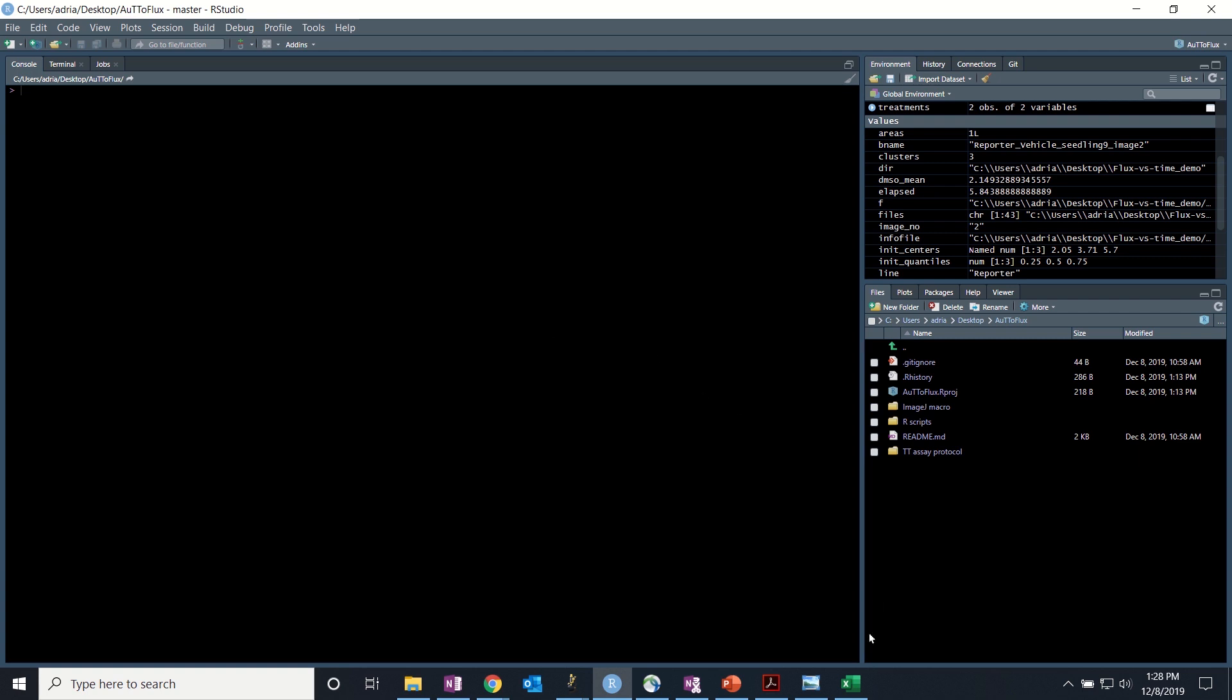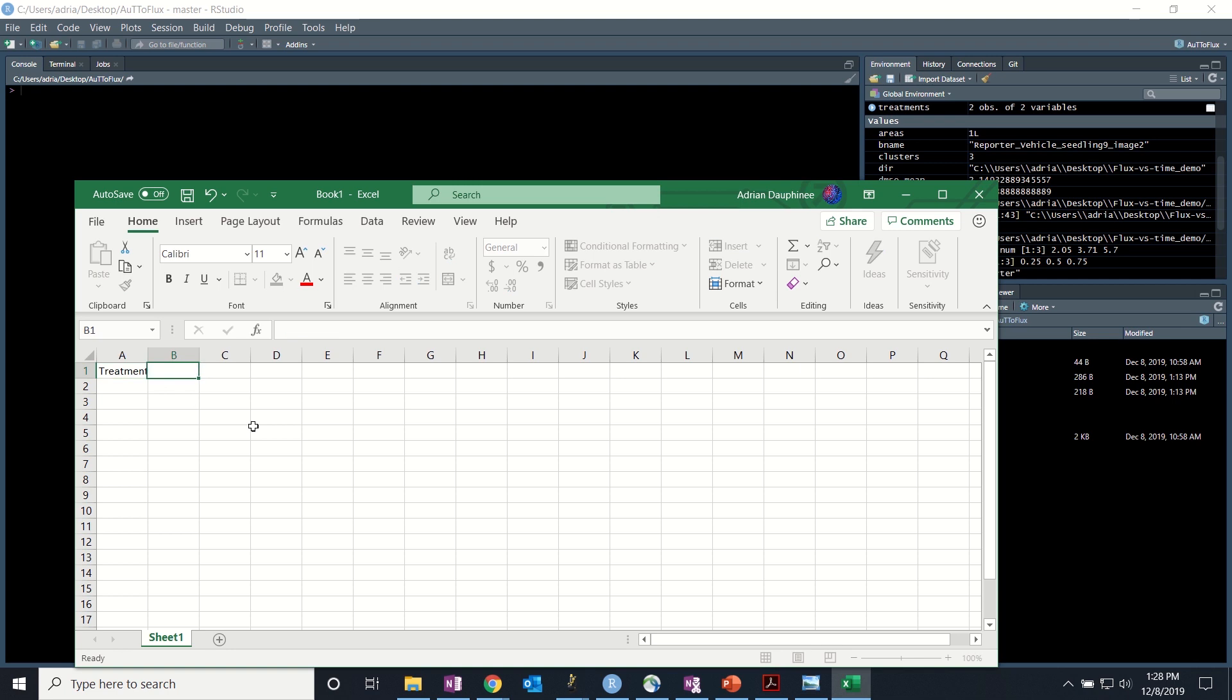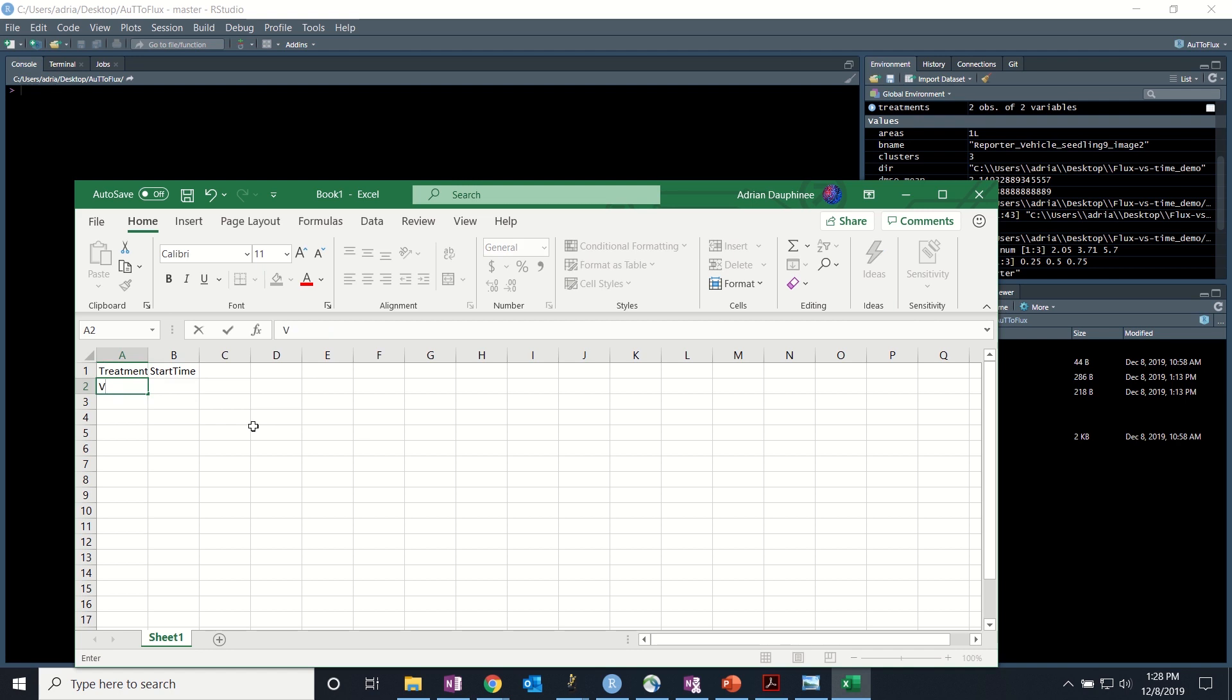Before we run the script, however, we need to create an info dot txt file and we'll do that with Excel. There needs to be two columns. The first one is treatment and the second one is start time. Please note that everything in this document has to match perfectly to your file.